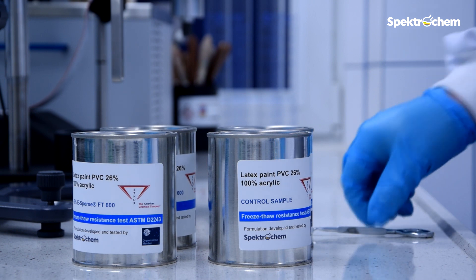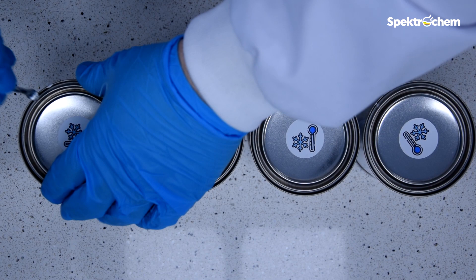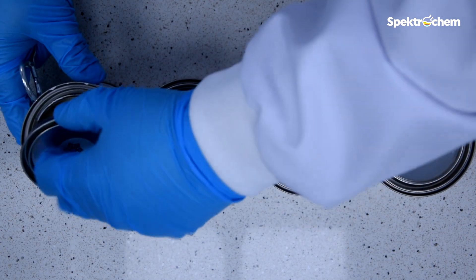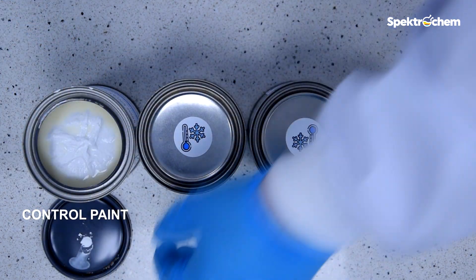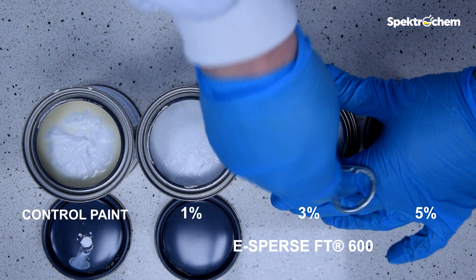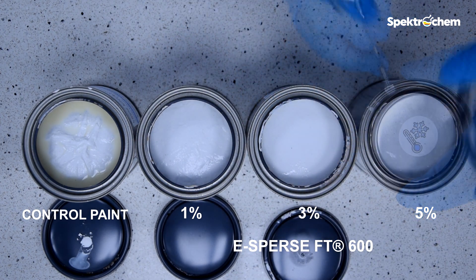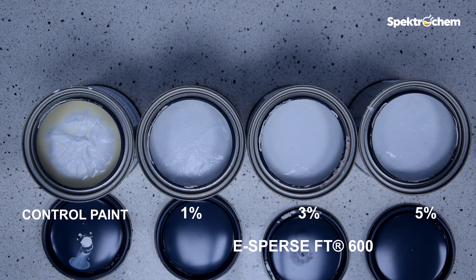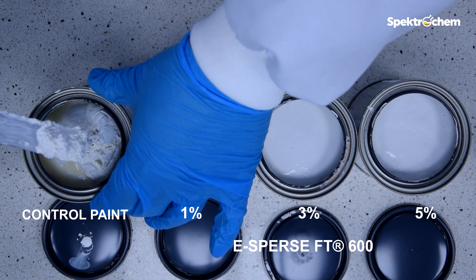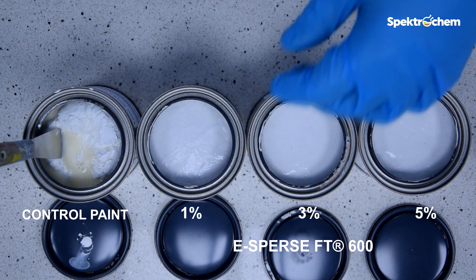It's time to assess the conditions of our samples in the cans when the test is completed. The control samples show a rubbery appearance and the paint is damaged. It's still liquid but forms chunks and a thick cottage cheese texture. This indicates a rating of 4, as a moderate failure.